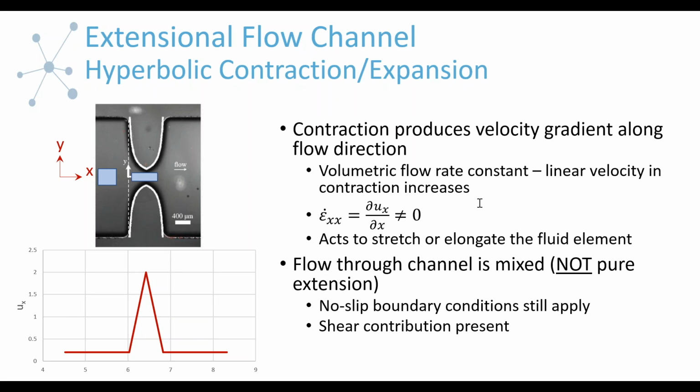There's another question here about investigating low viscosity polymer solutions, and whether this is meaningful. Let me step back. I think low viscosity polymer solutions can be meaningful. The example pressure profile that I gave you was actually for a low viscosity polymer solution. The polymer was very high molecular weight, though, around 7 million.